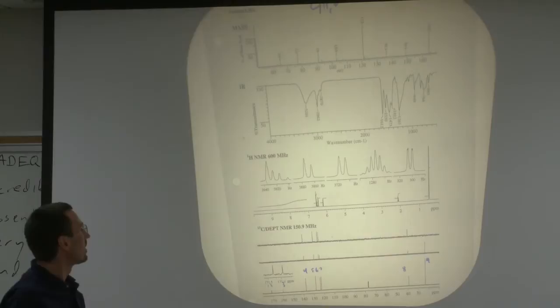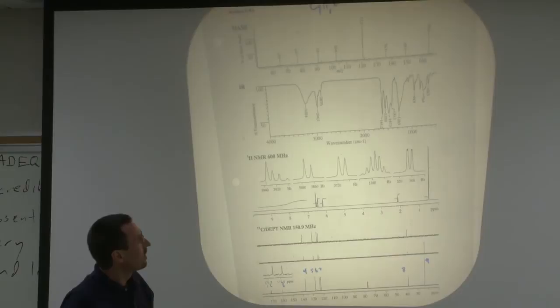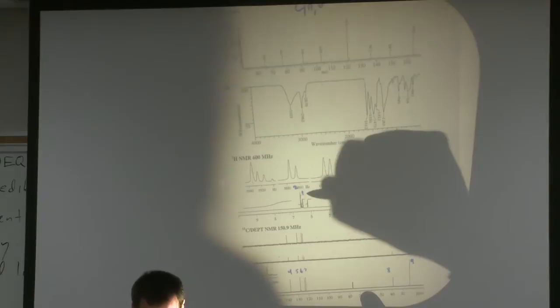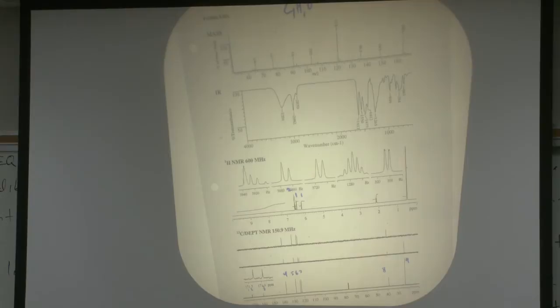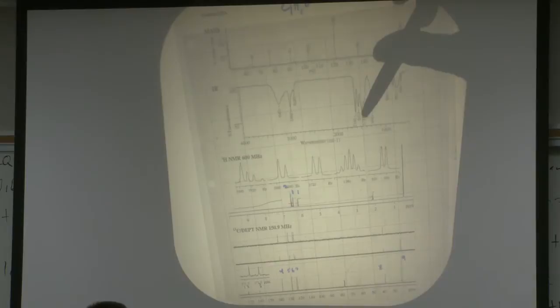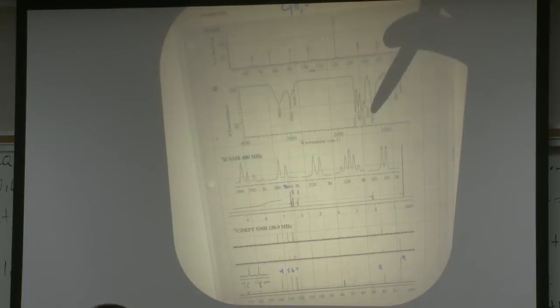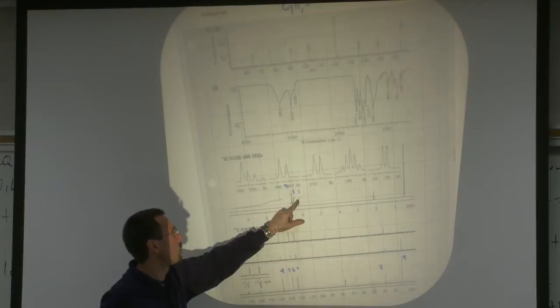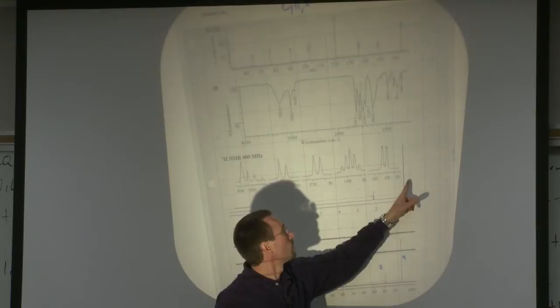and yet if you look at it, you'll see something interesting about the proton NMR. If you just work your integrals, you'll see 2, 1, 1. You usually measure with a ruler, or you can slap a grid on it if you're feeling lazy and you don't want to be bothered drawing lines with a ruler. My preferred way, if you can get a hydrogen count, is always to add up all your integrals here. So if I was adding this up, it'd be like 1.7, 1.7, 1.7, 1.7. And then what are we at? We're at about 9.3, and then divide by the number of hydrogens.